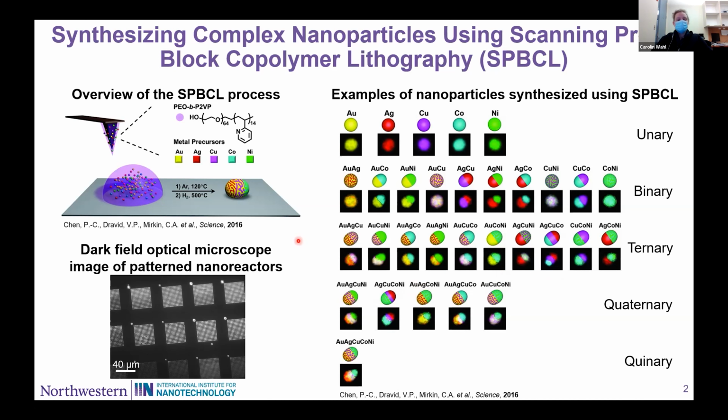Because the advantage of having a nanoreactor is that the spatial confinement that those precursors are in forces them to coalesce into a single particle, even though they aren't miscible really. So we can get particles that contain one or more interfaces between different structures. So that makes them intrinsically interesting for us to study, because we have single nanoparticles with immiscible phases that can have all kinds of orientations and interfacial structures in there that might have a number of interesting properties that we might be seeing there.